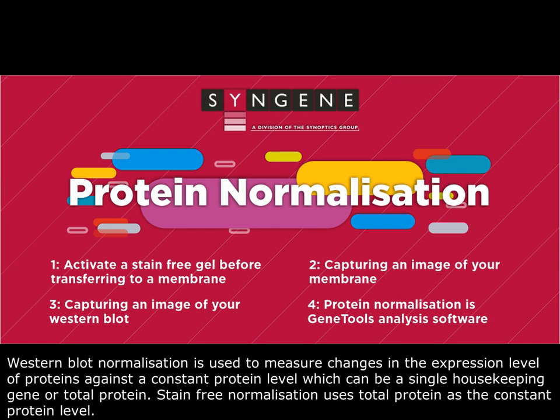Western blot normalisation is used to measure changes in the expression level of proteins against a constant protein level, which can be a single housekeeping gene or total protein. Stain-free normalisation uses total protein as the constant protein level.